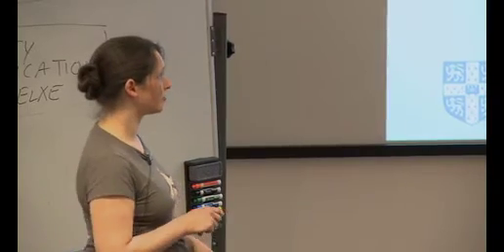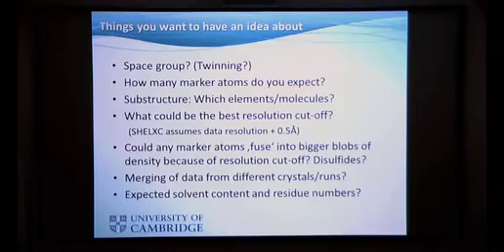And many people think the program does some kind of very special refined thing there, but it's actually just 0.5. So if you have a better idea, if you see against the resolution your d double prime contribution and you think, no, it's really only going to 3, please try to cut it at 3 and possibly at 2.9 and 3.1.